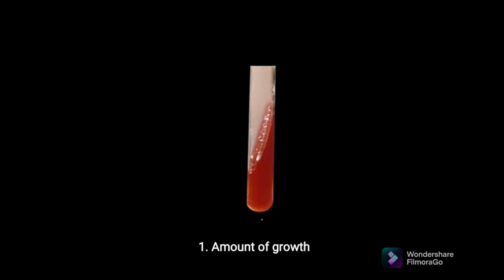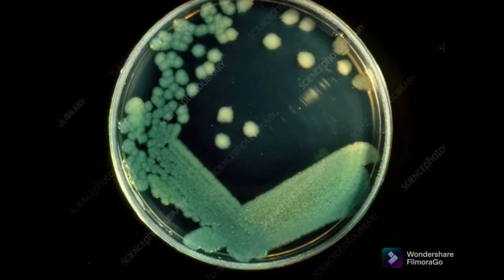Amount of growth. Pseudomonas aeruginosa is a common free-living gram-negative bacterium that can cause significant disease as an opportunistic pathogen. Rapid growth, facile genetics, and a large suite of virulence-related phenotypes make P. aeruginosa a common model organism to study gram-negative opportunistic pathogens and basic microbiology.